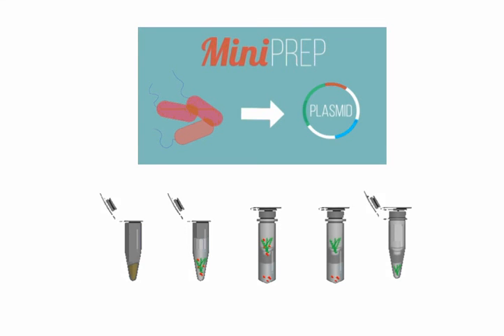This is a lab skill that is present in many biotechnology labs, so they're going to get the exposure of actually doing some real life biotechnology and not just stuff that happens to be from a kit. In fact, another way to look at this is they're making their own kit here, and they're essentially making the kit for the following year's class. So I'm not going to go too far into the process of the mini prep, but if you have any questions, you're more than welcome to ask me.